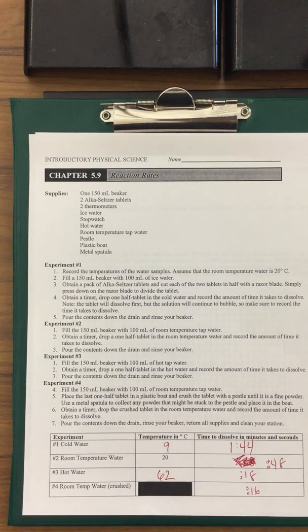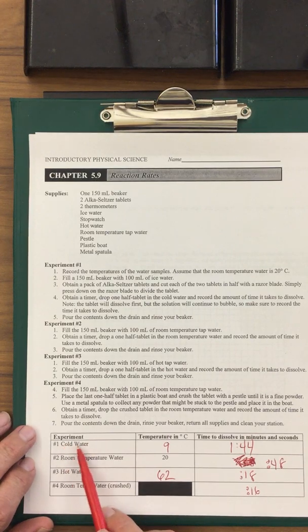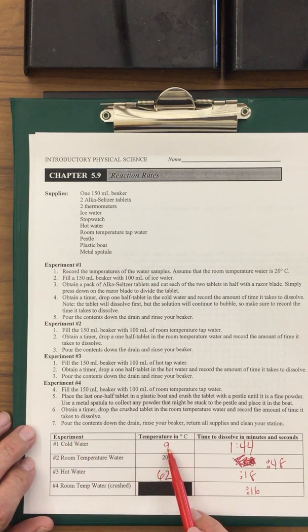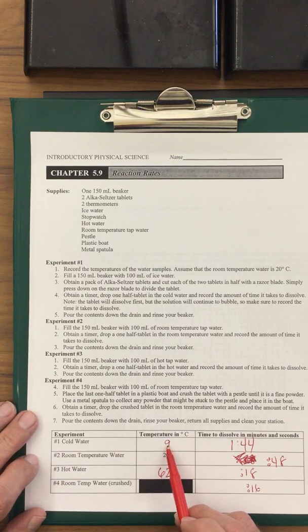Here's the conclusion of the reaction rates. So here's the data in case you didn't record it. Just to recall, when we did the first experiment with the cold water, the temperature was 9 degrees Celsius and the time was 1 minute and 44 seconds. This was the longest time because it was the coldest.